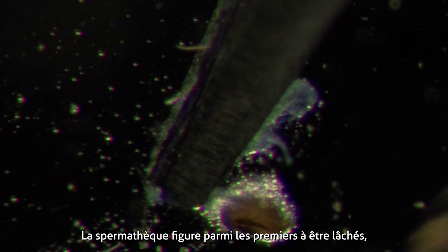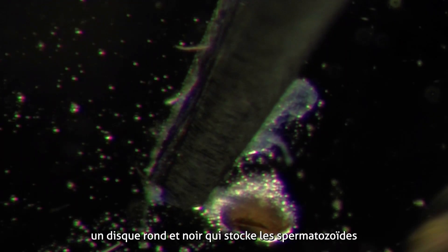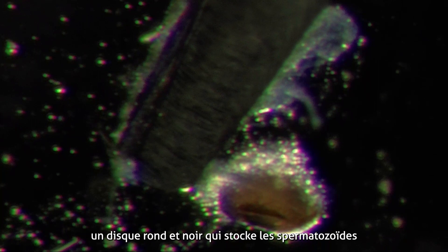Internal organs remain attached to this last segment. Among the first to be released is the spermatheca, a round black disc that stores sperm transferred from the males to the females during mating.